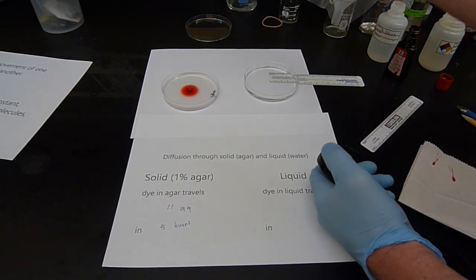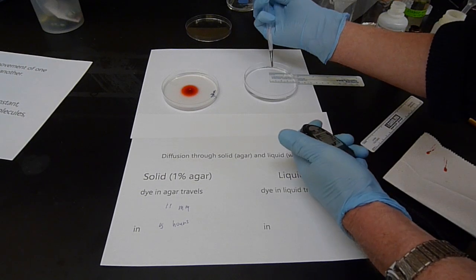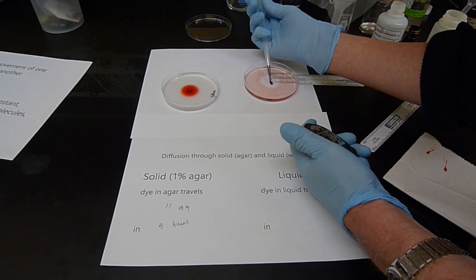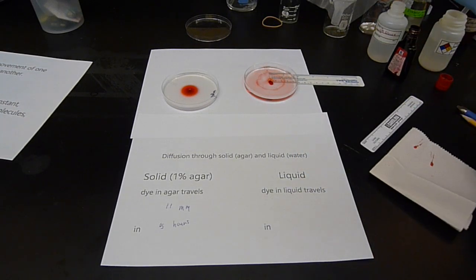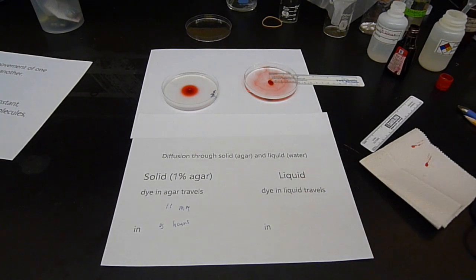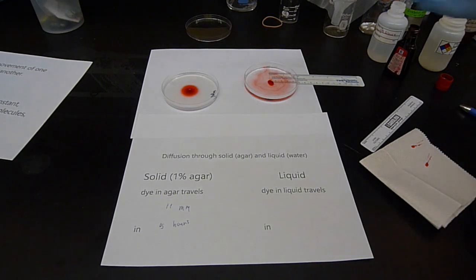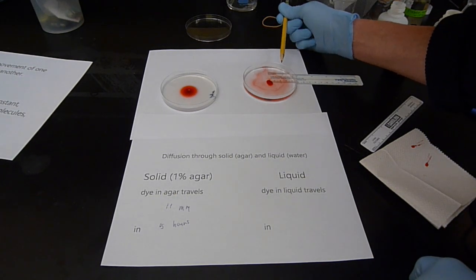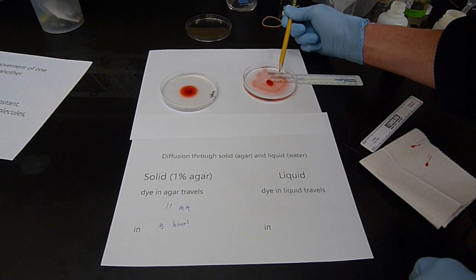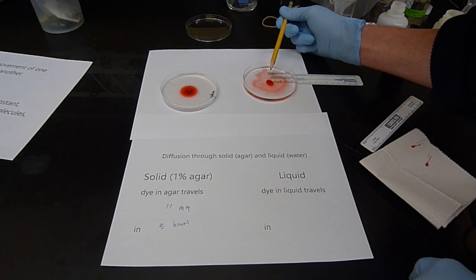So what we want to see is this dye moving from that initial place. I'm going to look at here and say it's like 5 millimeters right here. And in a few minutes, we'll come back and see how far this spot has diffused. We're not worried about the dye scattered along the surface and so forth.